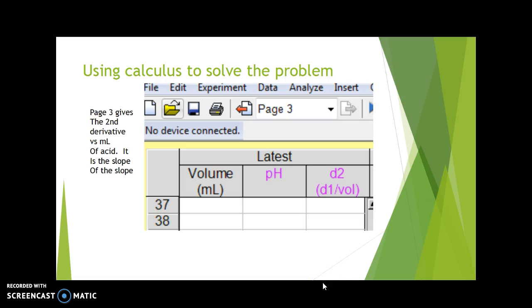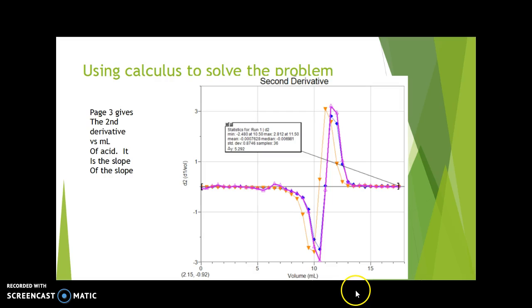Page three plots the second derivative of the pH against the milliliters of acid you've added. What the second derivative is, is the slope of the slope of the pH curve.